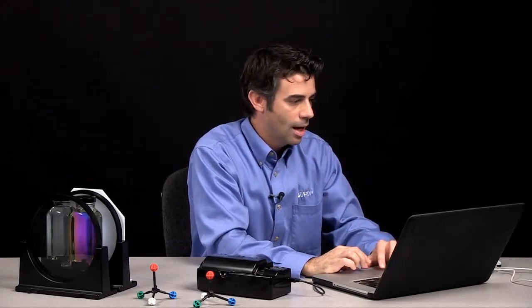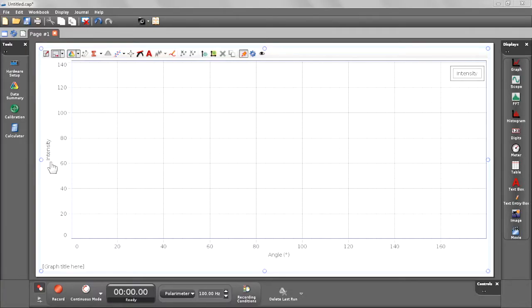So over here, I have my polarimeter attached to the software. I have a graph of intensity, light intensity versus the angle. So I'll be able to measure the angle of rotation. And I'm just going to hit record.